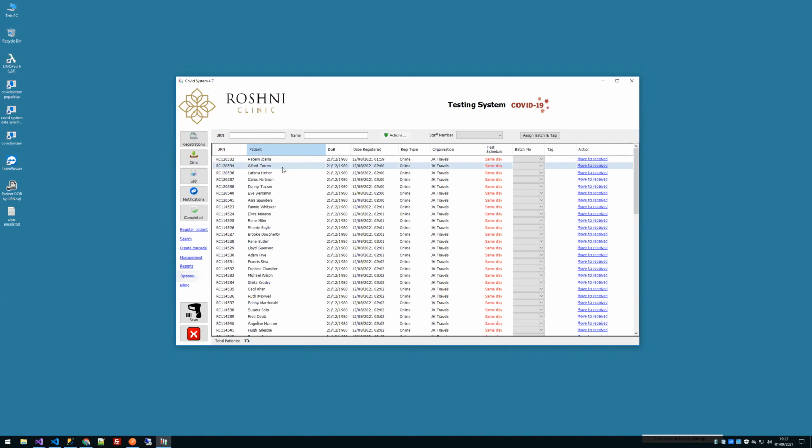Maybe something I need to show you guys, or maybe some of you need to run with a test patient, so you can see exactly what notifications you get and whatnot. But I think there's a lot in the system that's made it simpler. All those error prone issues just go away.